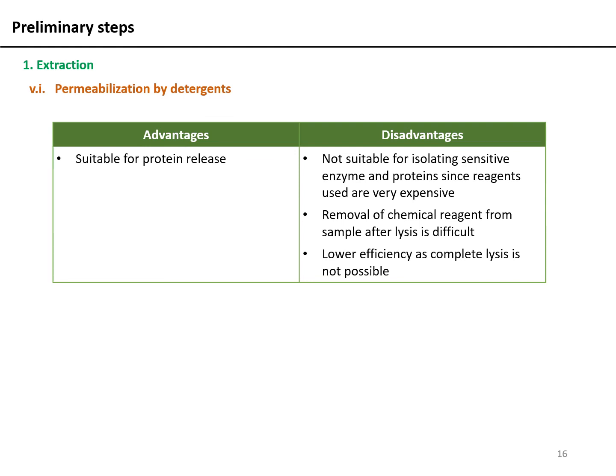So typically what is done is that a combination is used. For instance, you can keep detergent in the lysis buffer and then sonicate the cells. Or you can keep detergent in the lysis buffer and then go for Dounce homogenization. This combination of different cell lysis techniques helps achieve efficient cell lysis, and it has to be optimized not only for your system but within the system for the different proteins that you're purifying.